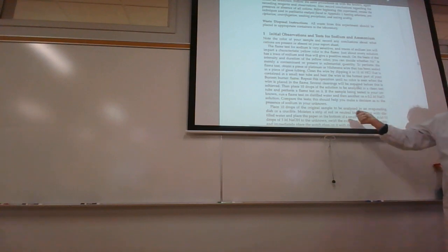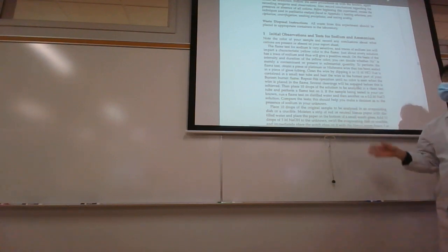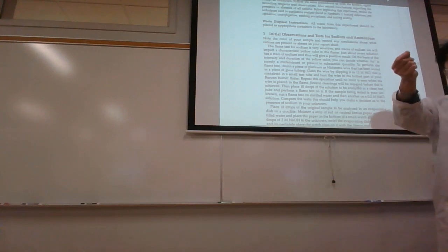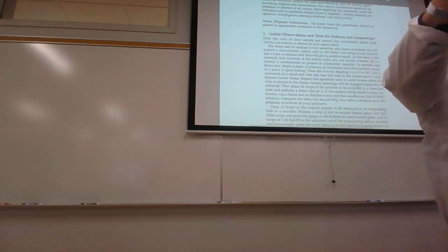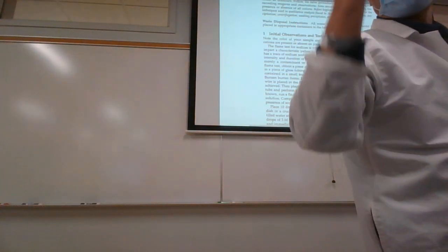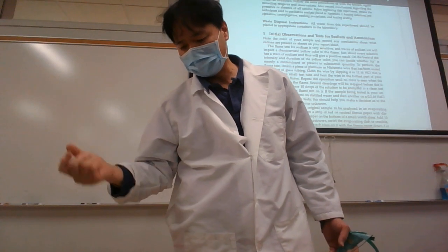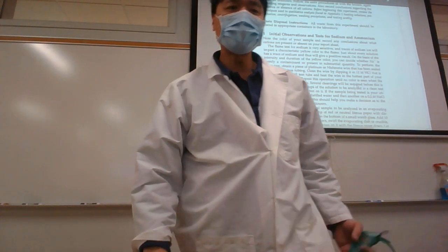In other words, sodium is ubiquitous, and it's so easy to contaminate anything with sodium. Anything you touch, you leave a sodium residue. Did you know that? So if I were to touch the wire with my finger, I'm going to test positive for sodium. Why? Because your perspiration is going to have sodium on your skin. Everything has sodium, including glass.